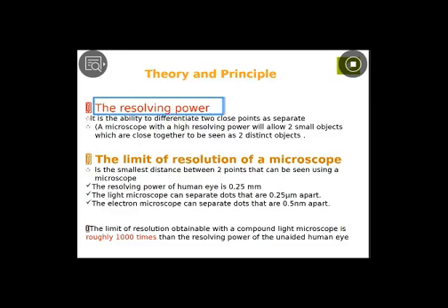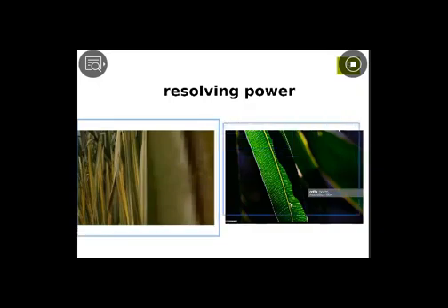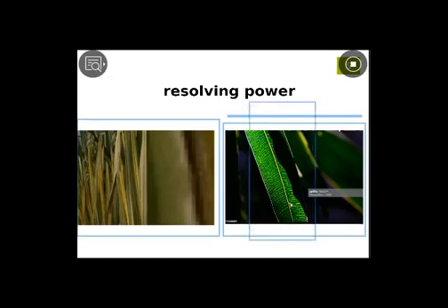So all of us have a mobile phone. In the mobile phone we have a camera. The camera has a resolution. Masalan, this is my camera, resolution is 5 megapixel. This is your camera, iPhone, resolution, masalan, I'm just telling you an example, 20 megapixel. So you can see which image is more clear. I think this image is more clear. You agree? It means that this image has more resolution power.